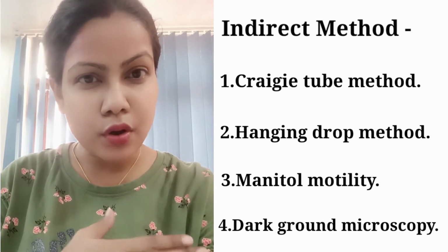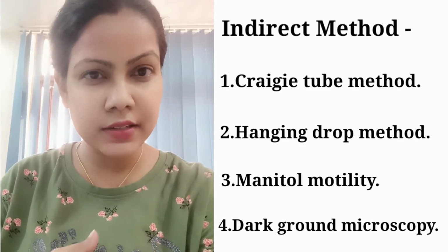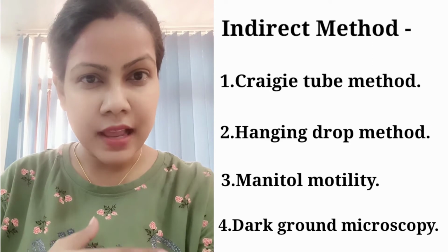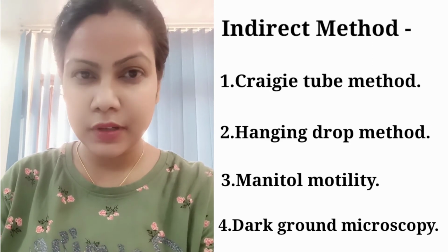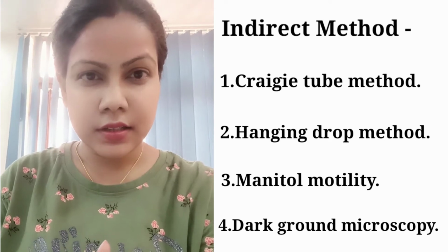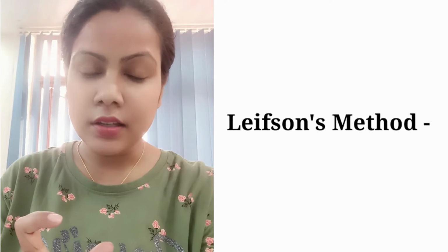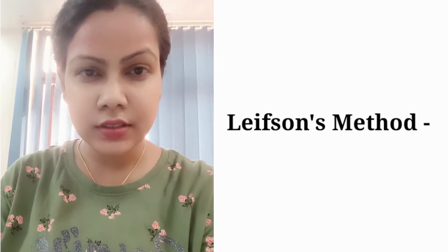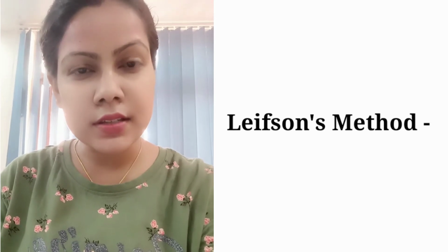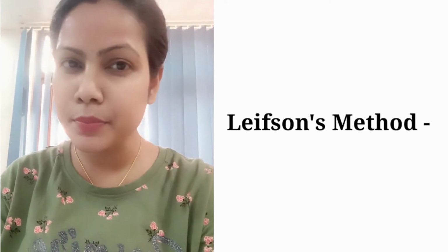I will discuss all the steps of how we can detect flagella in a flagellated bacteria one by one. But firstly, let's discuss Leifson's method. This is the direct method of flagellar detection, and how we detect flagella through Leifson's staining or Leifson's method.